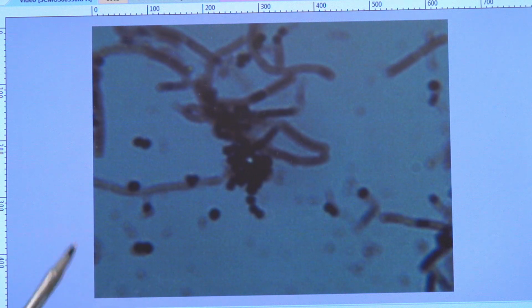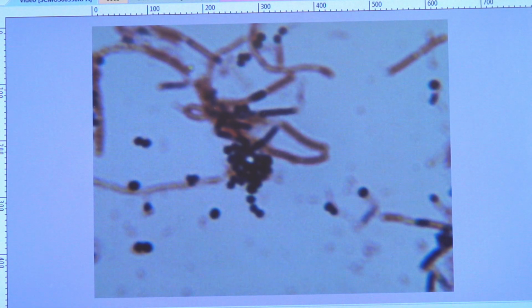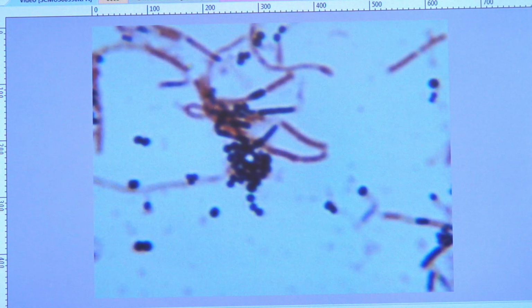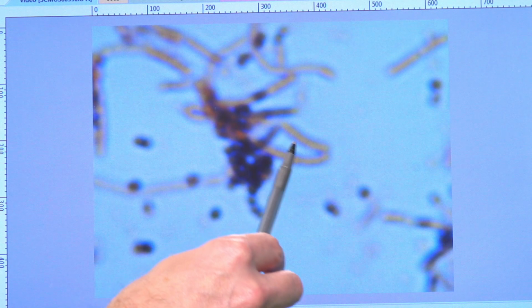Now on the screen, through the camera that's video recording us right now, we can't actually capture this. However, when I see the colors on this screen, I'm going to go ahead and open up the iris diaphragm to let in a lot more light. There we go. Some of the colors are popping now. And so what colors do we see here? Okay, so if we leave it a little bit out of focus, I think that's the only way. So what color is this?